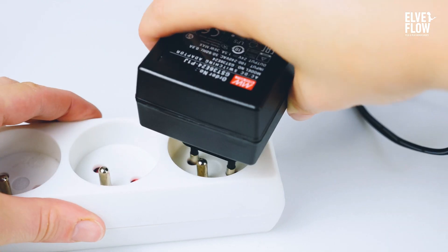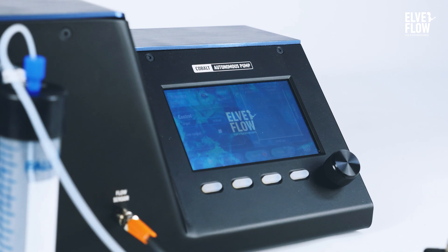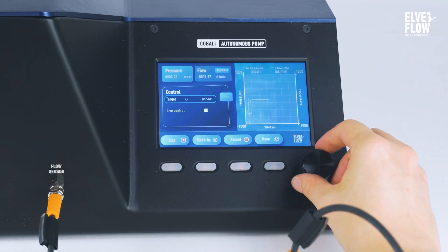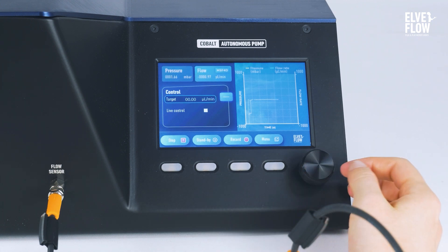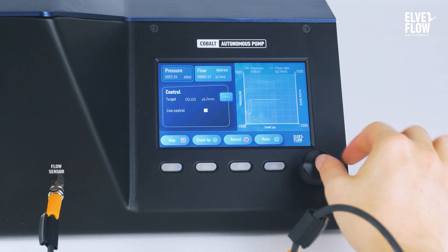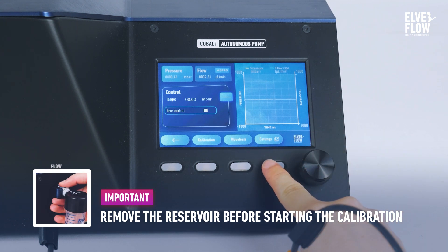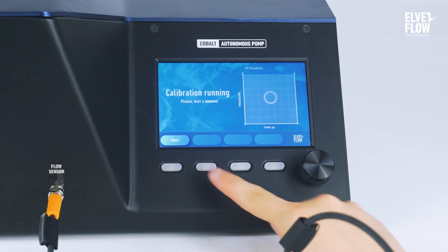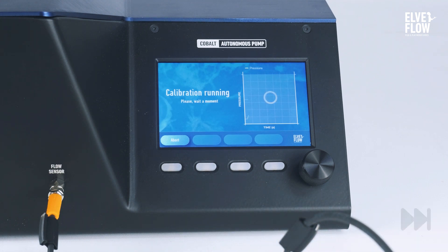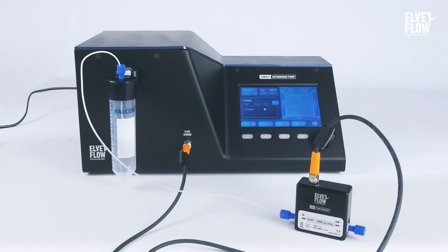Plug it into the power supply and turn the Cobalt on. As I mentioned, the intuitive embedded software of the Cobalt allows you to fully control it without needing external software or a computer. Look at this user-friendly interface — you can move around using the knob button and easily switch from pressure to flow control. Before the first use, you should calibrate your instrument. To do this, go to the General menu, then the calibration one, and click on Internal Calibration. Wait until it is calibrated. Now, your Cobalt is ready to use.